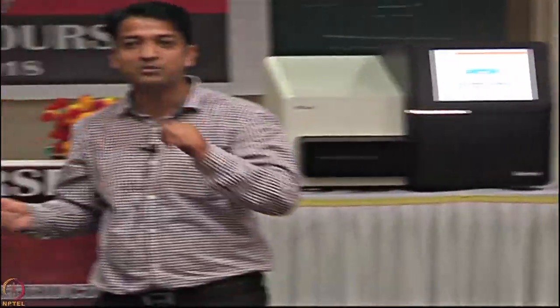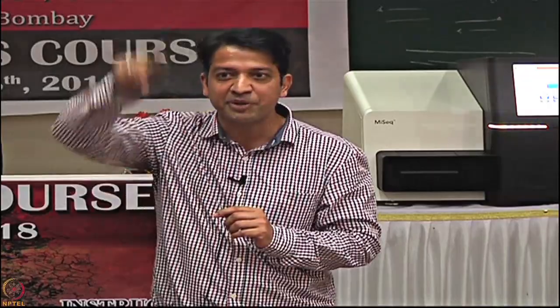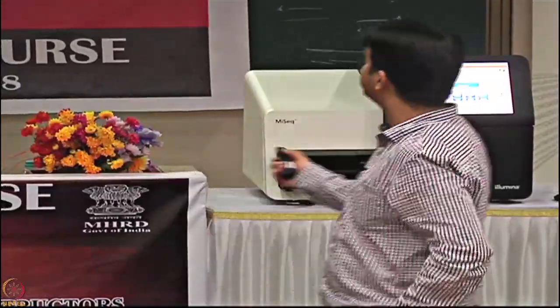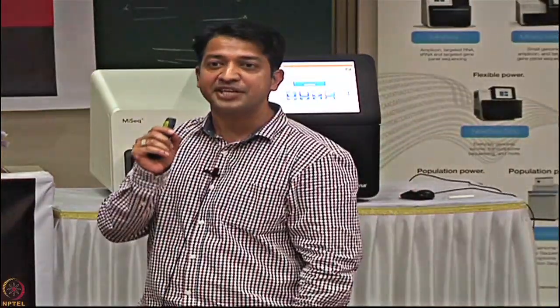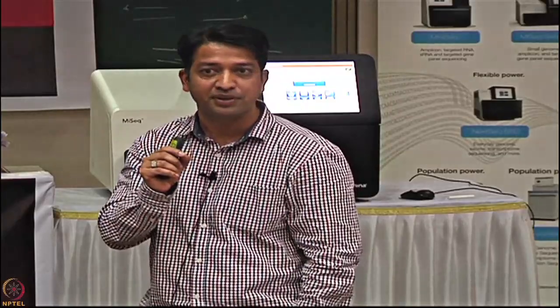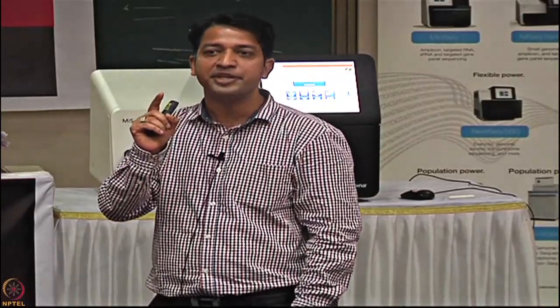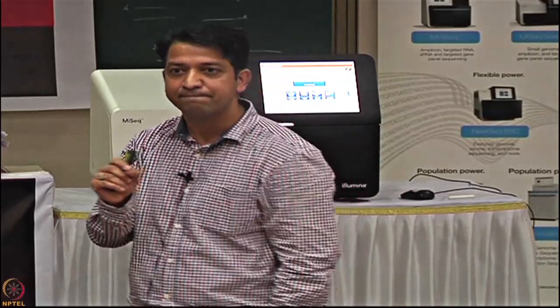So in terms of NGS, in Sanger, how do you detect the quality of the data? By looking at the peak. If the peaks are sharp, your call is good. In the case of NGS, we define the quality in terms of Q values, quality values. Illumina uses Q30 scores. A Q30 score means one error in 1000 base pairs added, so the accuracy rate is 99.9%.